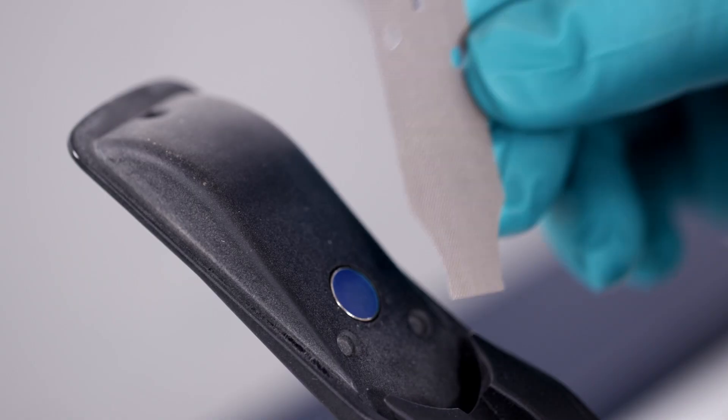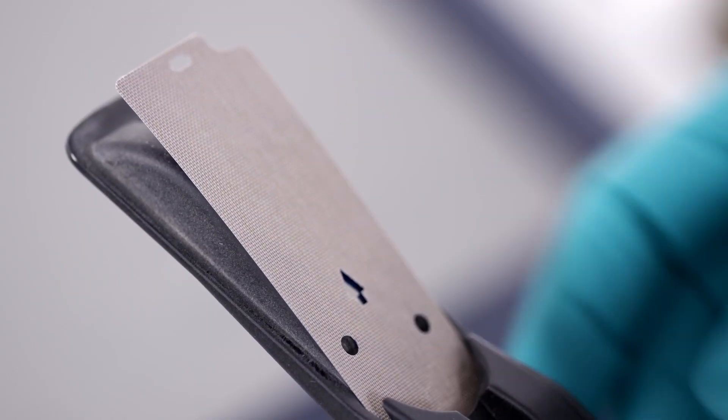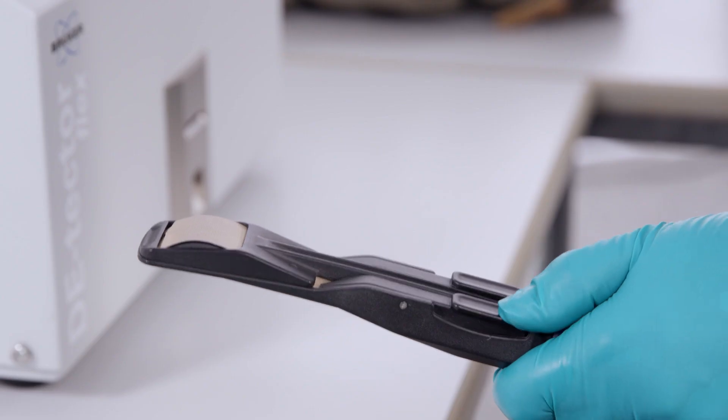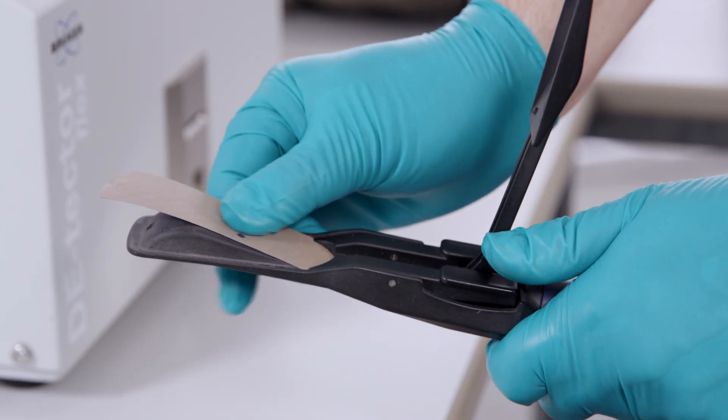The Detector Flex can be supplied with a full range of accessories, including a sample wand and consumables. Maintenance is simple, and a trained operator can replace filter and doping consumables by themselves.